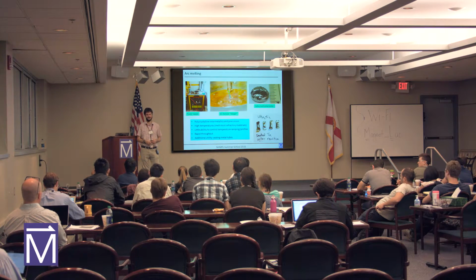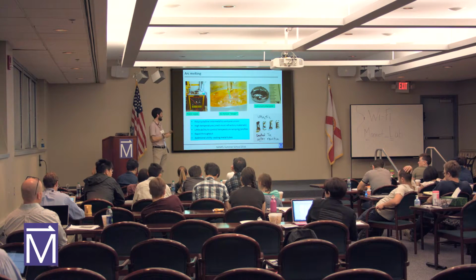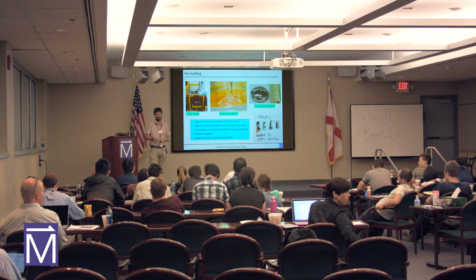The tantalum ages. When you first get it, it's very malleable. After a firing, it's very brittle.